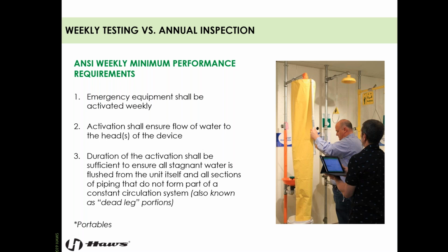On pressurized equipment, I would still jiggle the tank around and make sure it's full of water, but you're checking the pressure gauge on the piece of equipment to ensure that it's fully pressurized. Manufacturer's requirements are always listed on the tank, with the instructions on how to fill it and what the PSI should be. Double check those, check the gauge, and you're totally good.